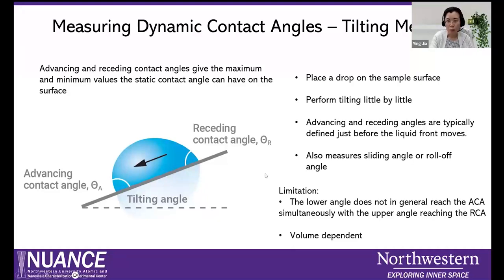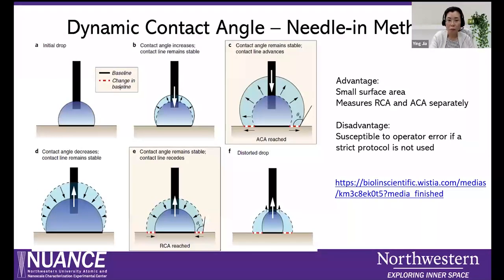So people came up with a better idea to measure this, called the needle-in method. It uses a relatively small droplet.